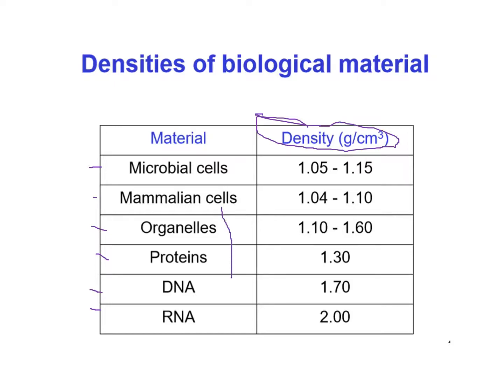So we have the nucleus here, and then the cytoplasm with its organelles there. Proteins can be in the organelles, and of course, there's histone proteins. Okay, that's my arrowhead associated with DNA. And again, we got densities. So right away, we're able to take advantage of the differences in the density of the material that we're trying to separate.